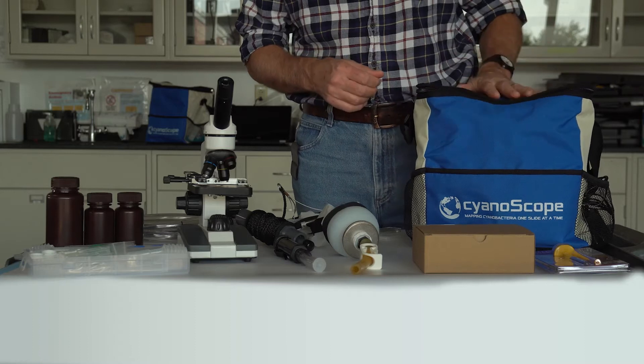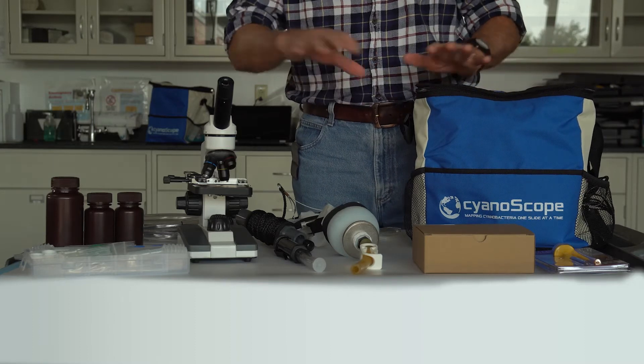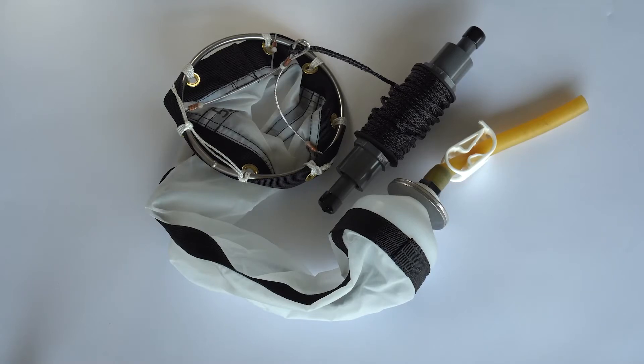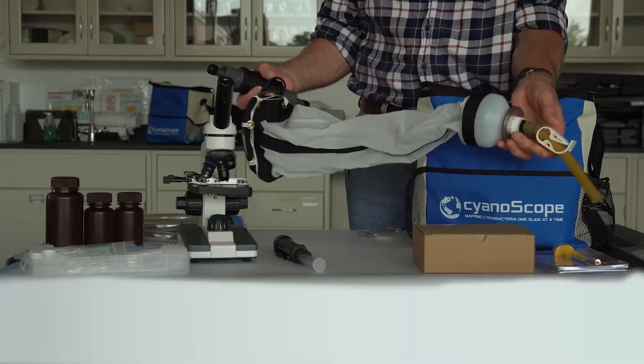In the case, you will find multiple tools you will use to collect samples to test for cyanobacteria concentration. This includes a 53 micron net that will concentrate your samples of phytoplankton and zooplankton.